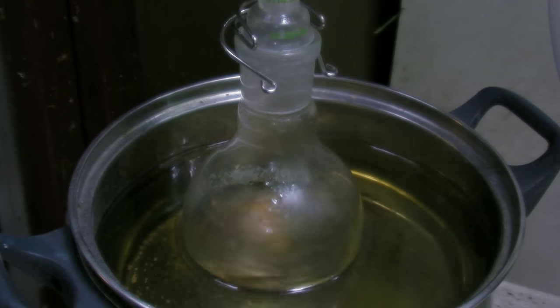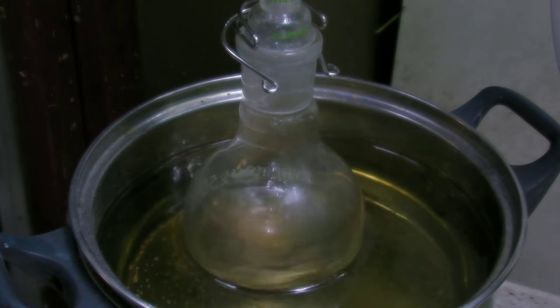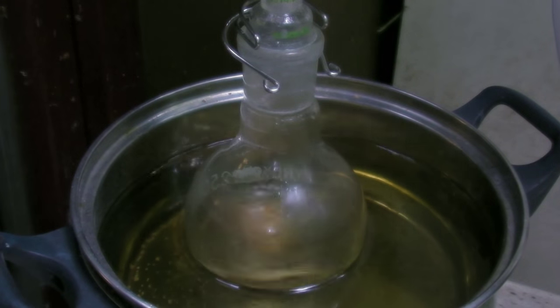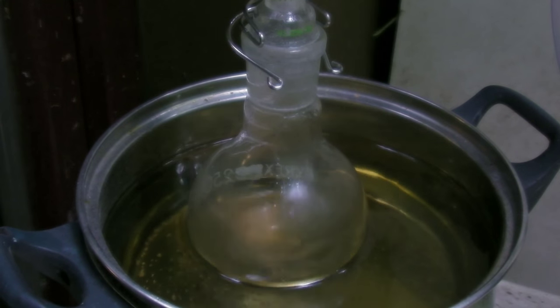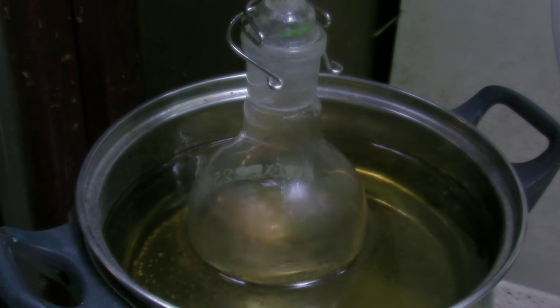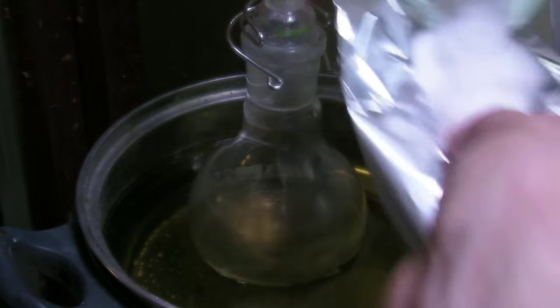In addition to that, reducing the boiling point of high boiling liquids increases the safety, because at the cooler temperature the glass is less stressed. However, there is a risk that the temperature drops significantly. If the drop is too high, the glass could break. It is possible that the substance condenses completely at the joints, so it's highly recommended to isolate these parts.